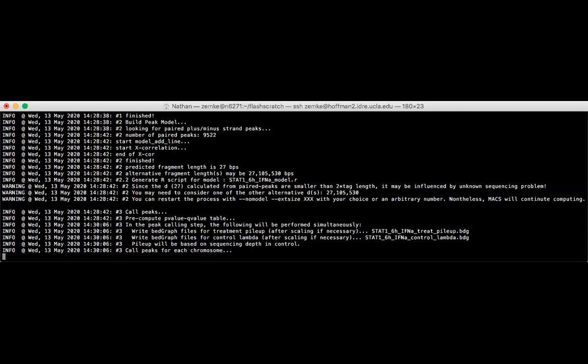So as soon as this finishes, I will start the conversion of the bedgraph to a wiggle and the bedgraph to a bigwig, and also the peaks file into a bed file. And then I'm going to download the IGB, the Integrated Genome Browser program. Of course there's other genome browser software. If you're familiar with other ones and you have one that you like better, feel free to use that. I like IGB, so I'm going to be using that one.